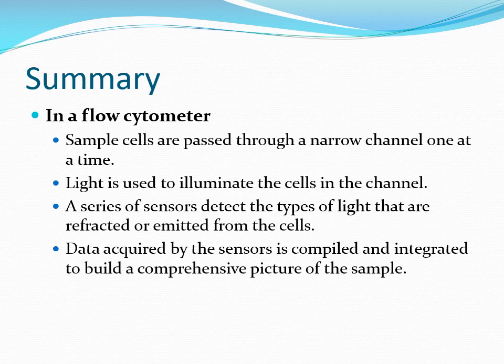So to conclude, we may summarize the entire process of flow cytometry in very simple terms. What happens is that the cell samples pass down through the narrow channel in a single file. When they cross the interrogation point, light, that is laser, illuminates them, and these cells scatter the light. This scattering depends on various parameters: the size, the shape, or the complexity. These scattered light rays are then detected using basically two types of detectors: the forward scatter detectors, which lie in the path of the light, and the side scatter detectors, which are placed at 90°.